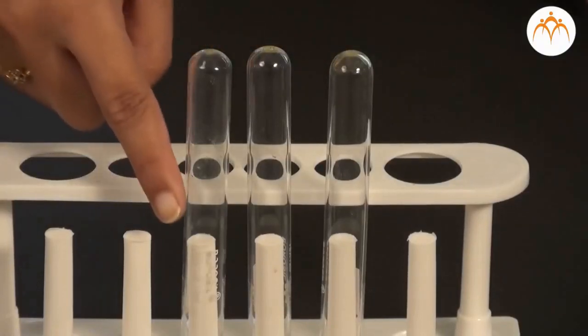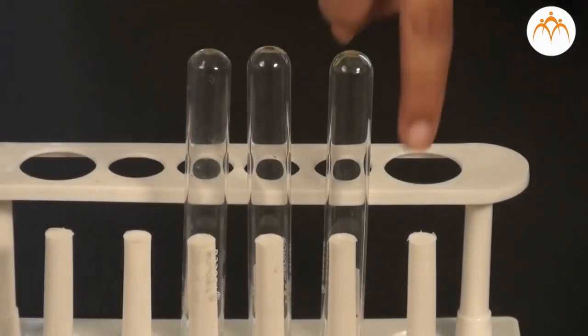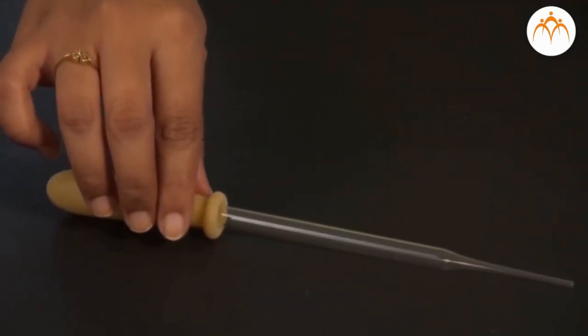In this experiment, we will identify chloride, bromide and iodide ions from the given salts. We need apparatus like test tubes, stand, droppers, etc. We also need the compound silver nitrate.